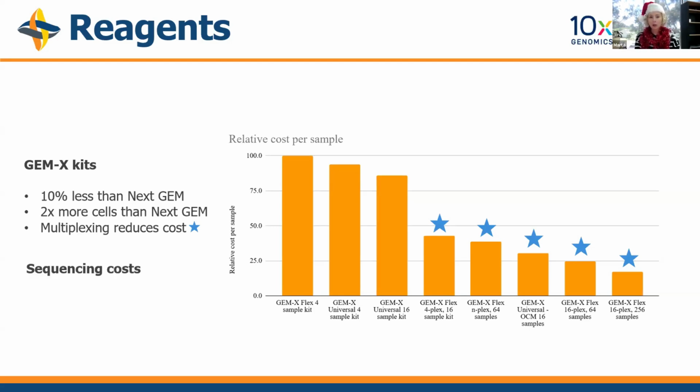Lastly, sequencing costs are additional costs. And when you are considering different ways of running single cells, you need to remember that sequencing is also included. That means there are no really true instrument-free assays if you need to do sequencing, unless you are planning to sequence on vertical polyacrylamide gels, which I don't think you will. So there is always an instrument involved.